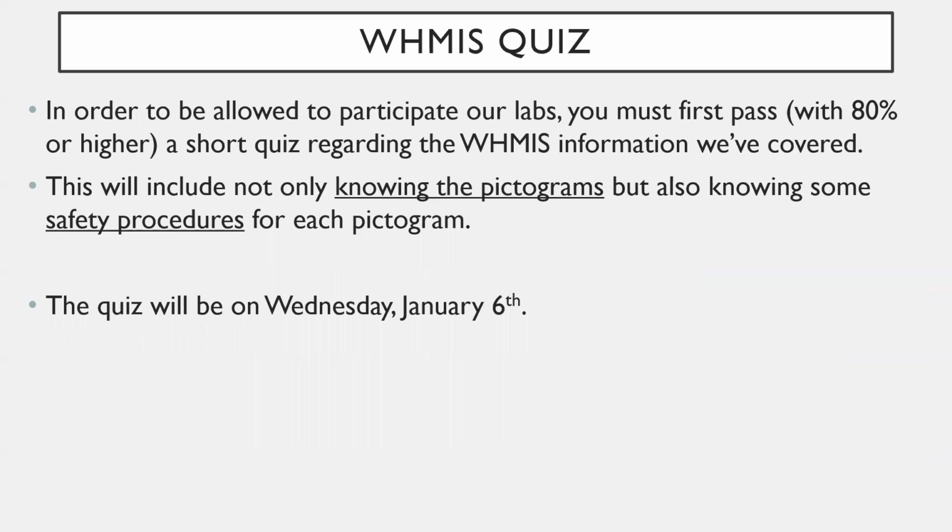All right, so the WHMIS quiz, that'll be on Wednesday. In order to be allowed to participate in our labs, you must first pass with 80% or higher a short quiz regarding WHMIS information we've covered. This will include not only knowing the pictograms, so you'll have to know what they mean, but also knowing some safety procedures for each pictogram.